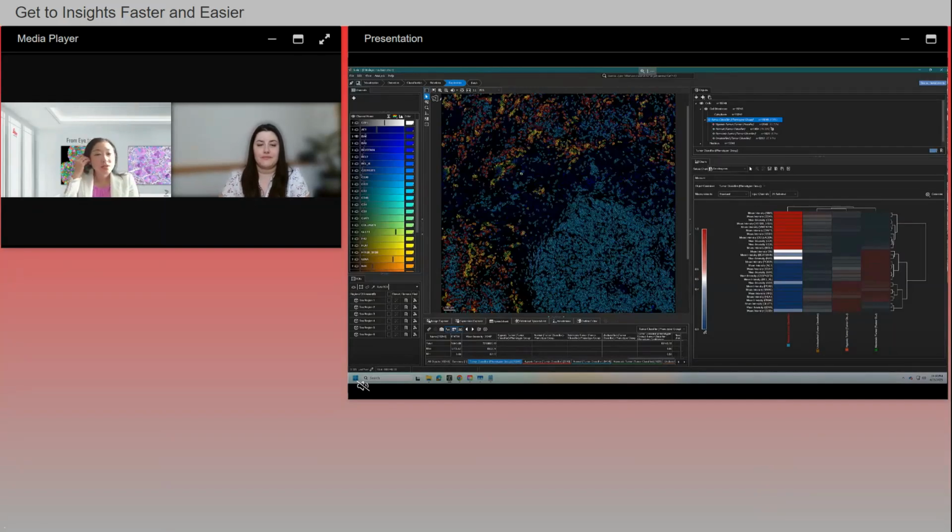Great question. Despite the fact that this looks a lot like many of the painting tools for training, such as the pixel classifier which Aivia has, there's absolutely no training involved. We're simply deploying a pre-trained deep learning model based on the parameters estimated from users painting, which gives us the estimation for the cell sizes. Currently, we can handle various intensity variations and morphological characteristics for each cell, as well as the size, as I previously mentioned. So it's pretty versatile, and users simply have to paint on a single Z-plane to generate 3D meshes, as I've demonstrated. Great question. Thank you for that.